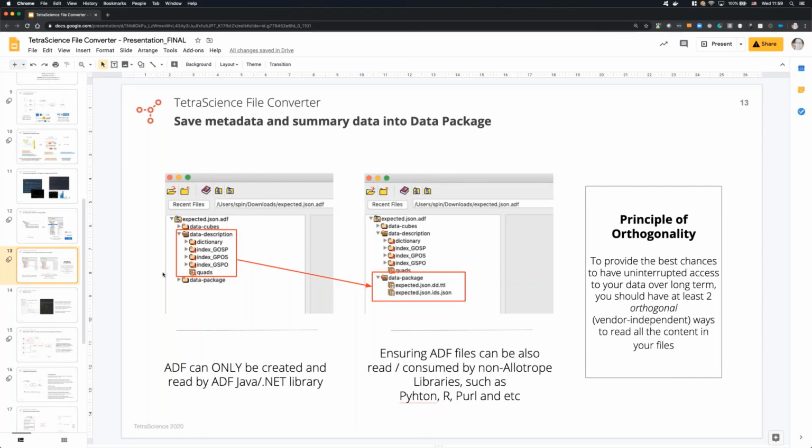Importantly, that includes the data model. If we just have raw data and the same words, but in different data structures, expressed in different forms or syntaxes, and they're not equivalent, then ultimately that data is not interoperable, such that you could overlay two chromatograms on one another.